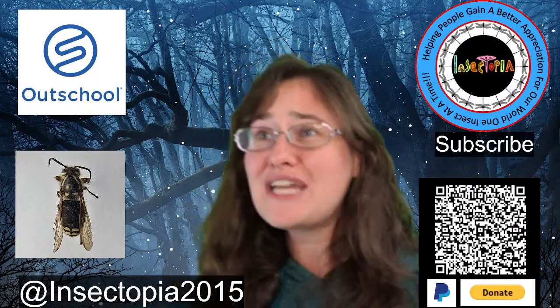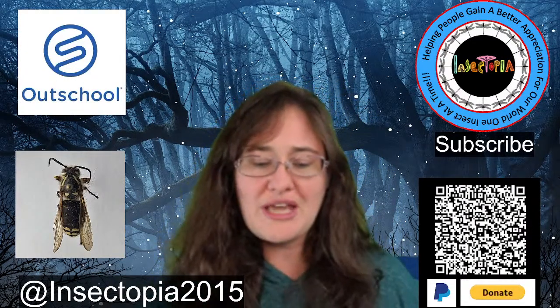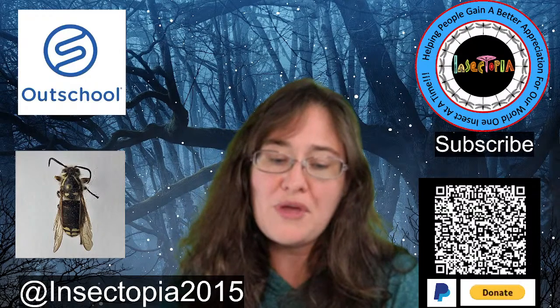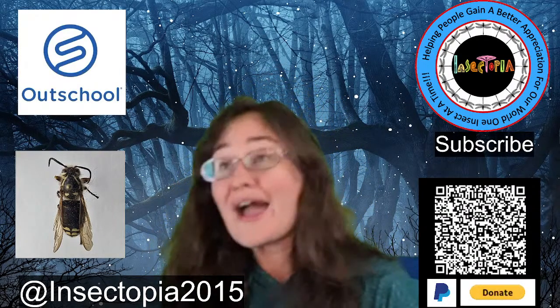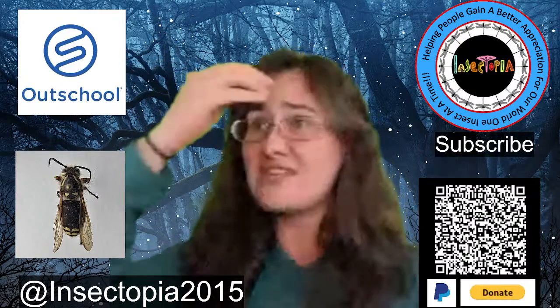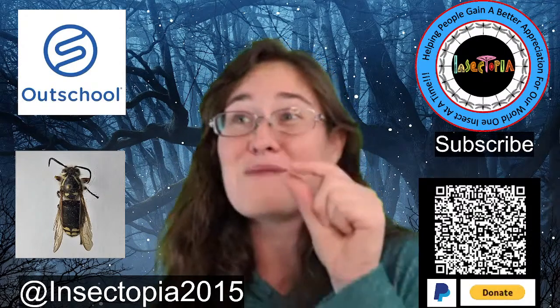I have to agree. It is. Looking at the legs and the antenna, and going through and looking at an animal that's unique and you've never seen before, now seeing it under a microscope, you get to see what it looks like and what it does and why it does it that way. Then you realize that those insects are just a very, very small population of a huge number of insects out there on the planet. There are millions of these things out there. And it took Trisha 3 hours just to go through her little itty-bitty collection.